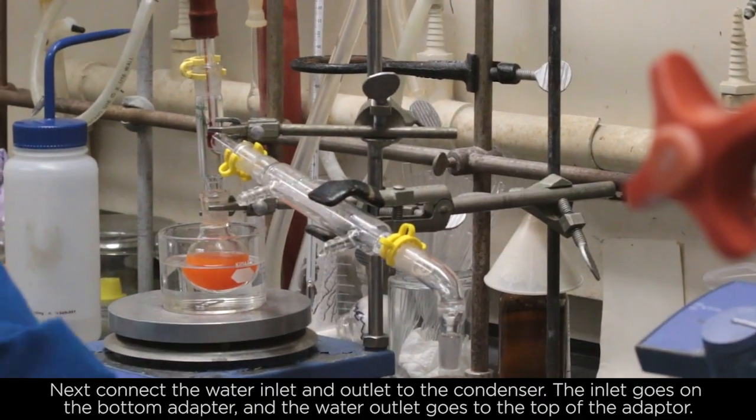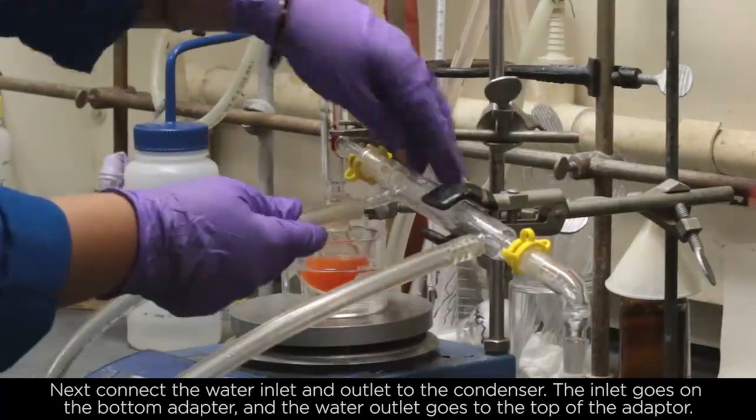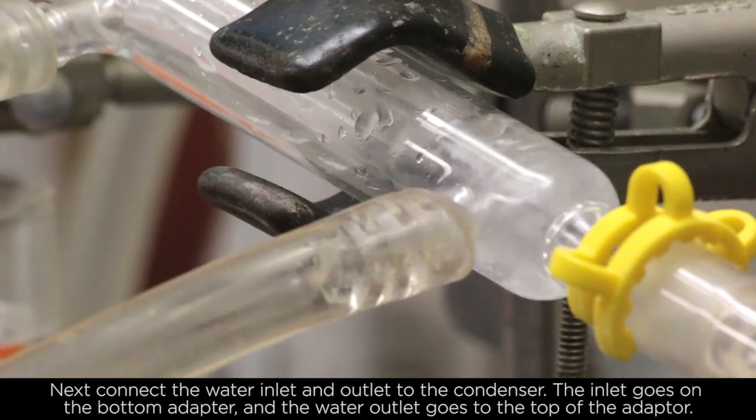Next, connect the water inlet and outlet to the condenser. The inlet goes on the bottom adapter and the water outlet goes on top of the adapter.